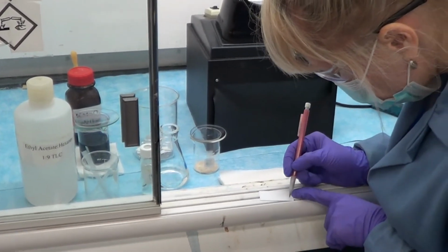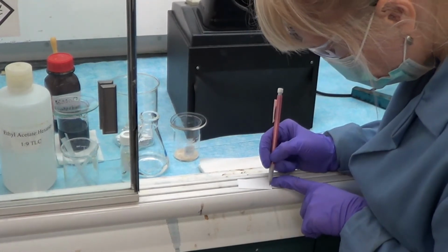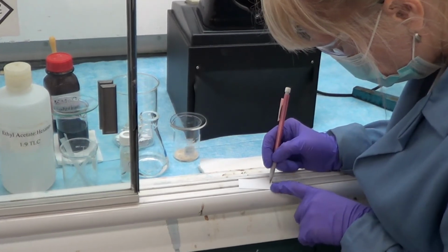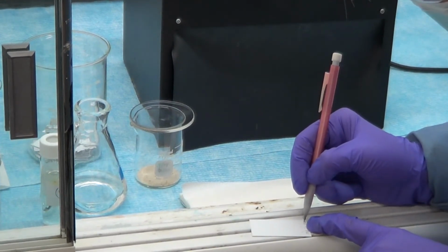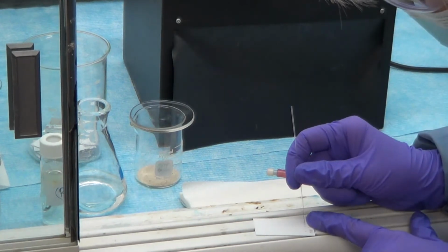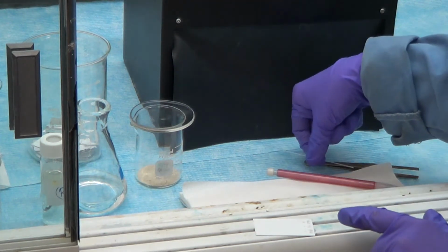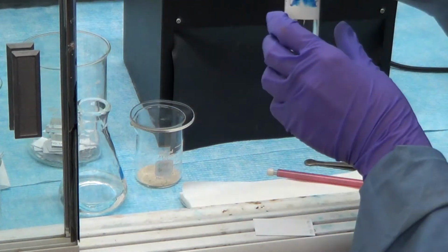Prepare a TLC that will contain 3 spots. The left spot will be an authentic sample of carvone. The right spot will be the filtrate. The middle spot is the co-spot. This means that both the filtrate and the authentic sample are spotted in the middle. This will help us determine if we successfully extracted carvone.